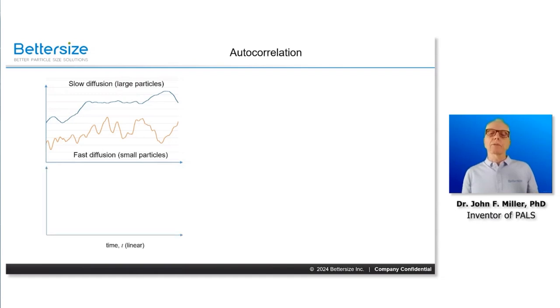For a random signal, there are two extreme limits in correlation. First, when the signal is compared to itself at the same time, there's a 100% correlation because the signal is unchanged, so the correlation function starts at 1. Second, if the signal is compared to itself after a long time, there's no correlation, so the value is 0. Typically, a gradual decay occurs between these extremes.